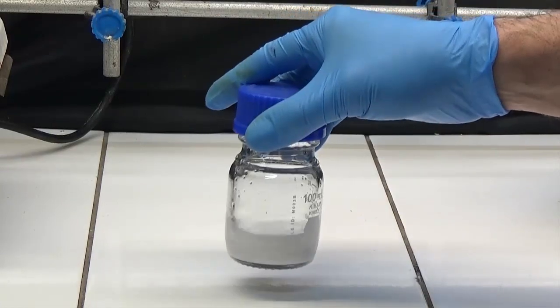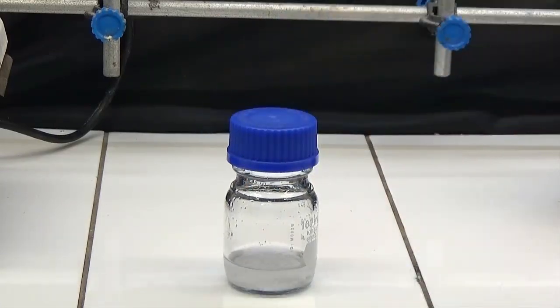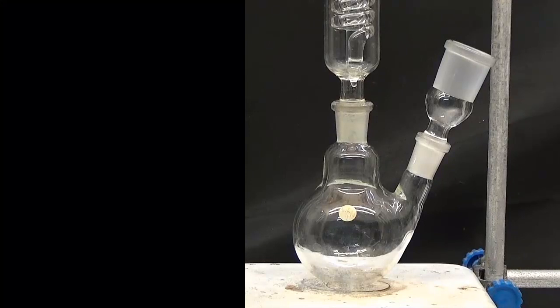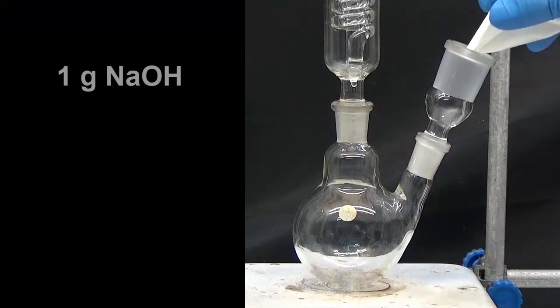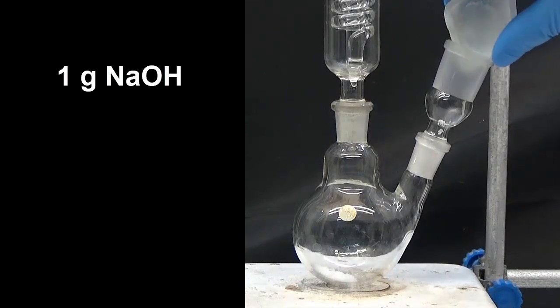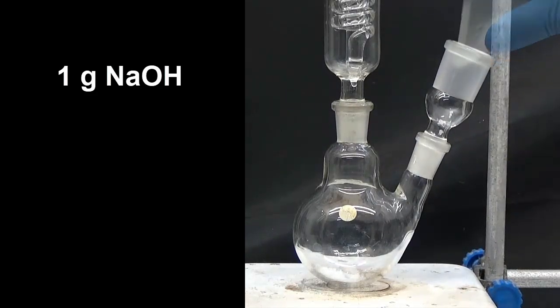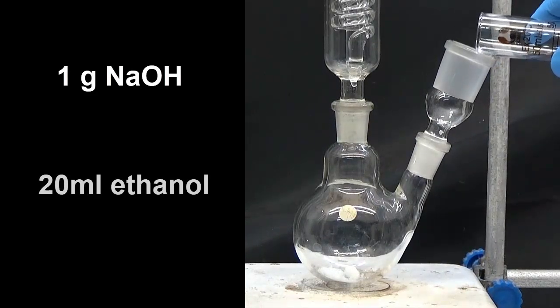With all the prepared reagents, we're going to synthesize phenacetin. In a 100 ml flask with reflux condenser, we put 1 gram of sodium hydroxide and 20 ml ethanol.